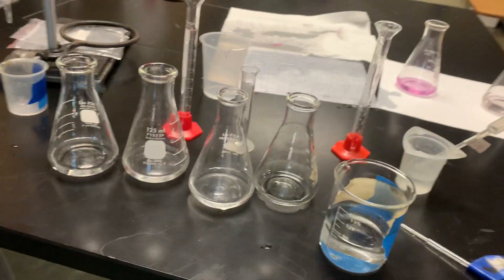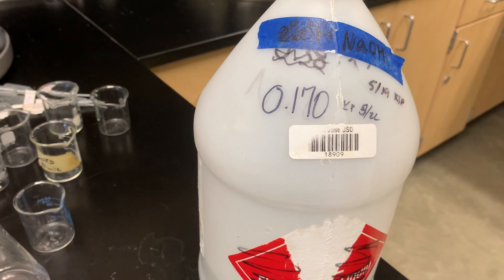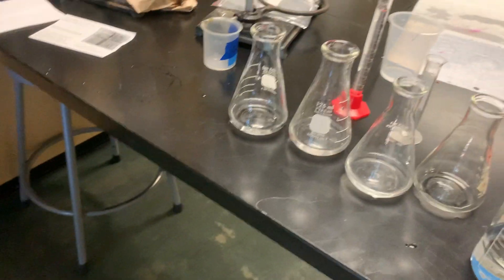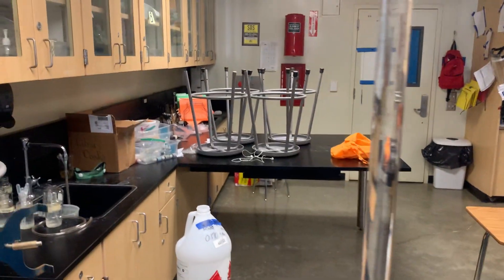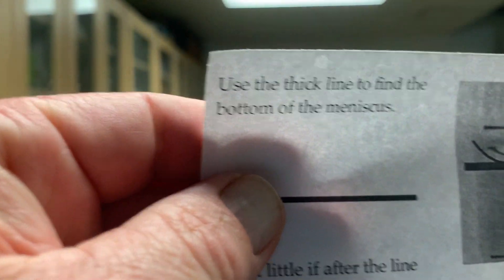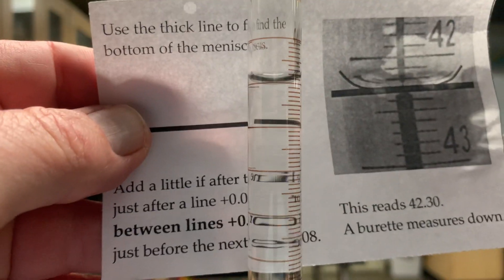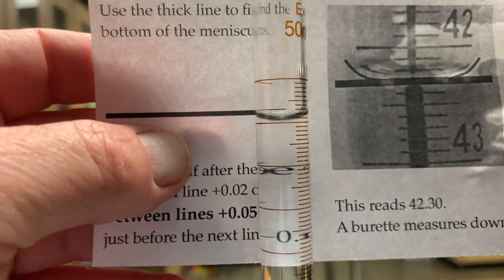The base I've added has a molarity of 0.170 and it's NaOH, and that's in this burette. Now to read the burette — this isn't going to be my starting spot — what we do is we read to the bottom of the meniscus line.